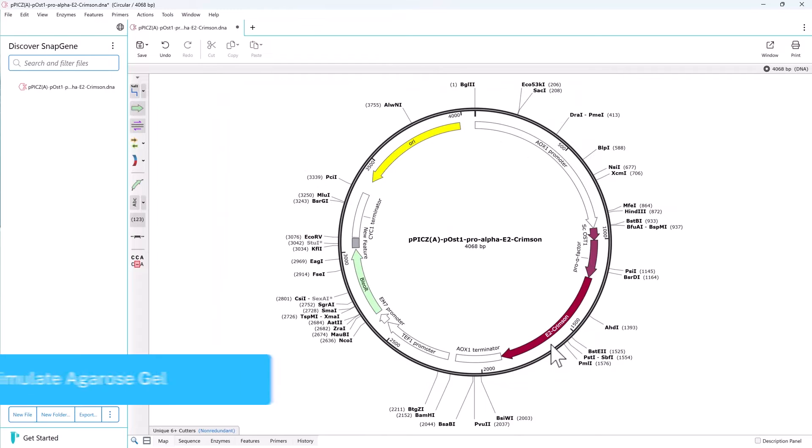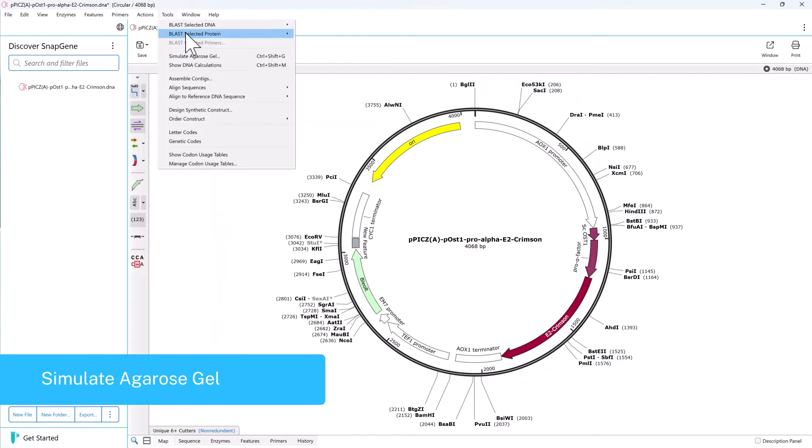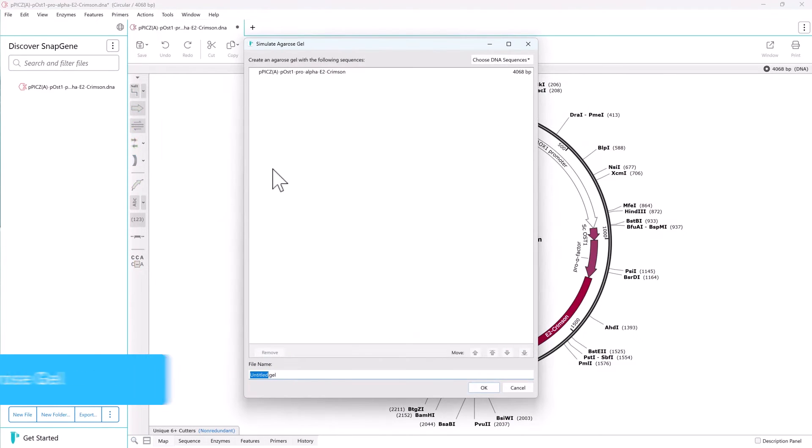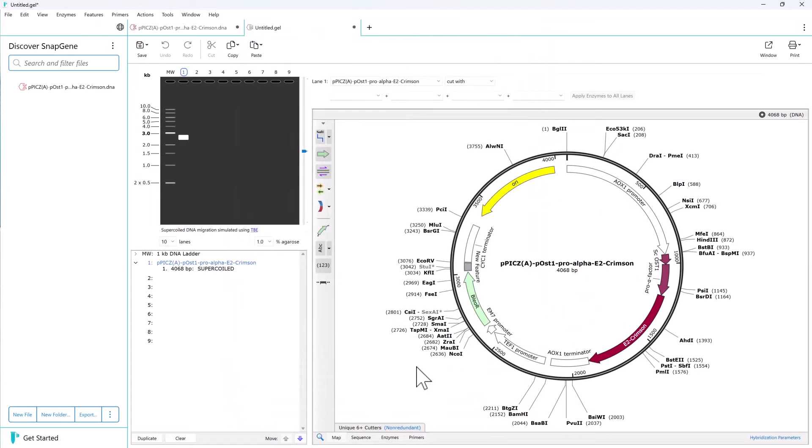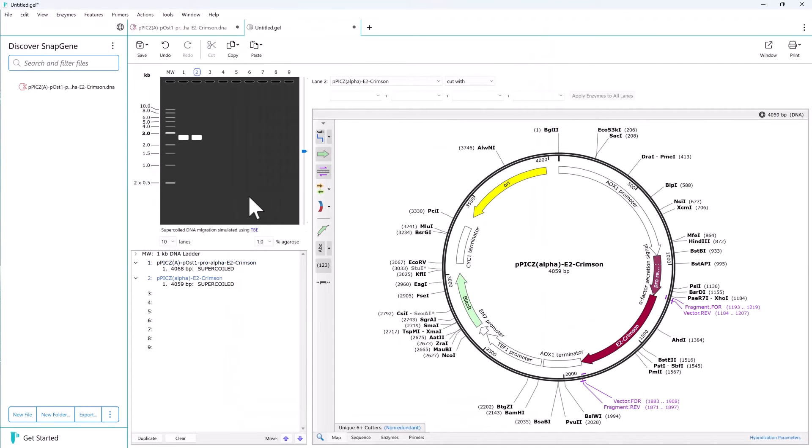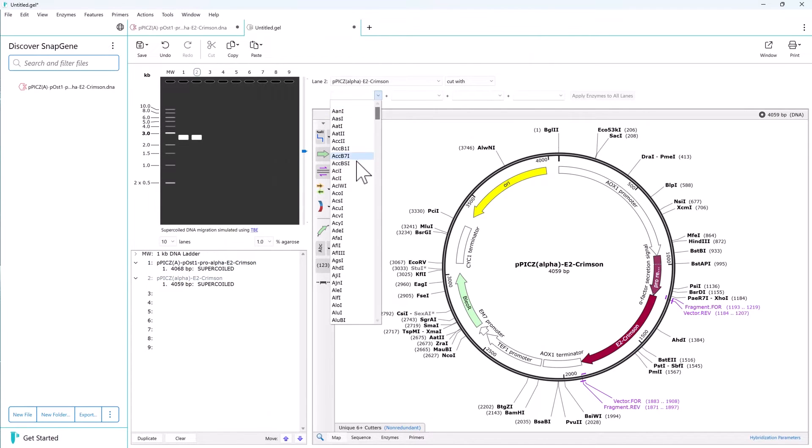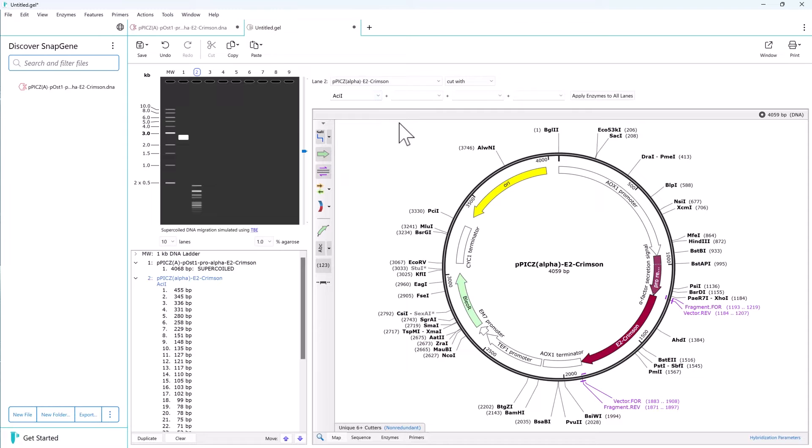There is also the ability to simulate agarose gels in SnapGene. Assign different sequences to different lanes and choose different combinations of restriction enzymes.